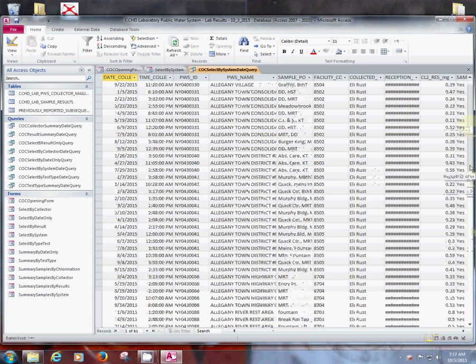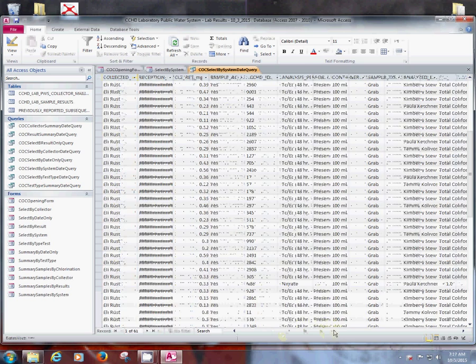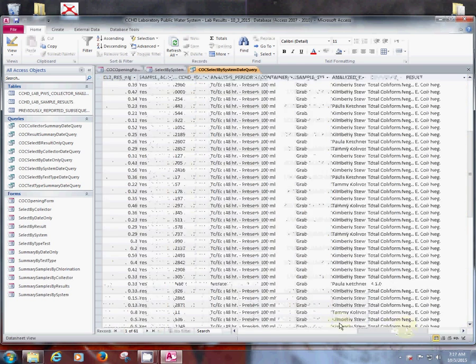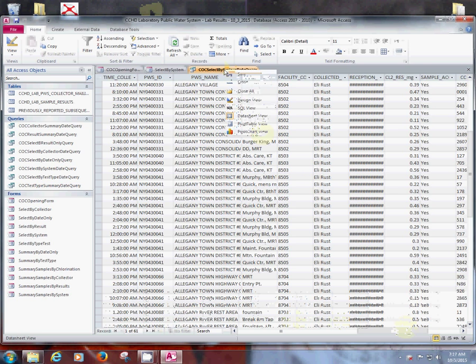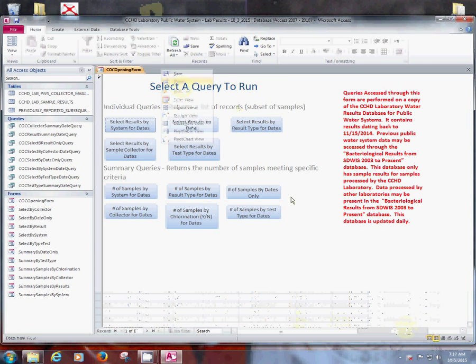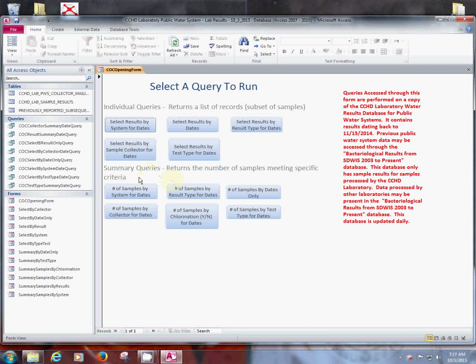Okay. You can check all of that out. Alright. Easy enough. If there are other queries that you think would be handy, let me know. But think about it before you let me know. Think about exactly what you're looking for. Be able to phrase it.